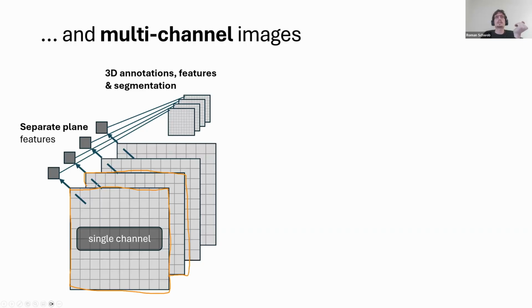So this is like an image, and then just stacked onto this, you have another one, and so on. That also makes it clear that in the end you want a 3D segmentation, right? Because you want to say at this depth, this pixel is maybe class 1. Here it's maybe class 2, and here it's maybe class 1 again. So these are really different parts of the image, just in a third dimension.